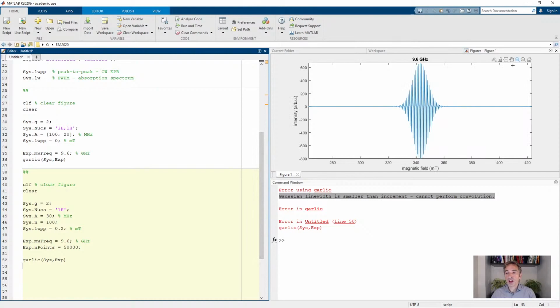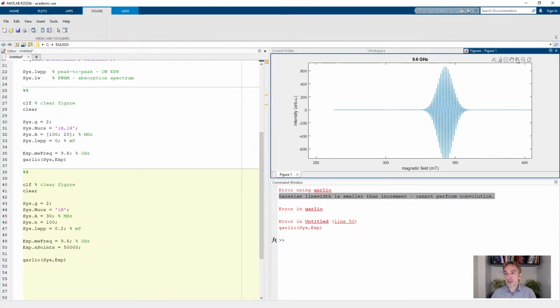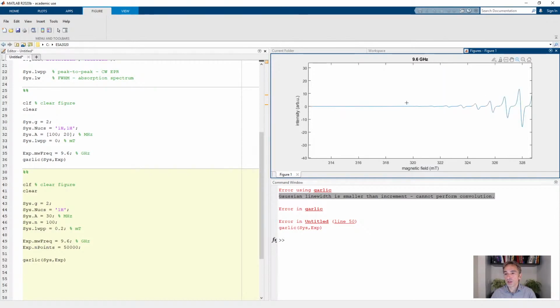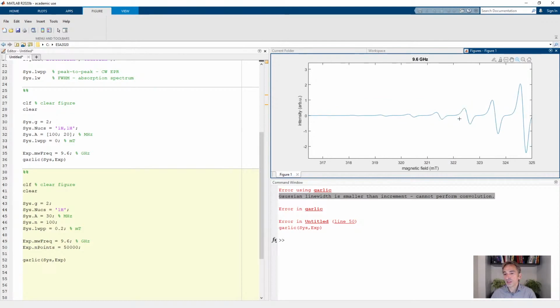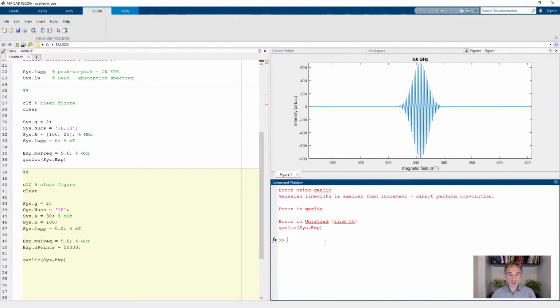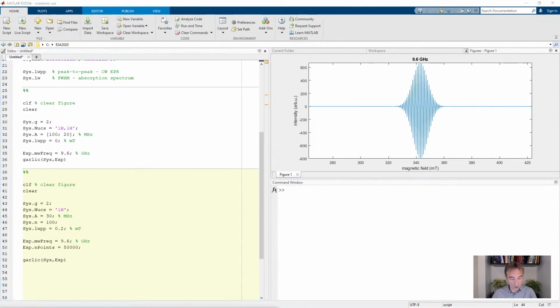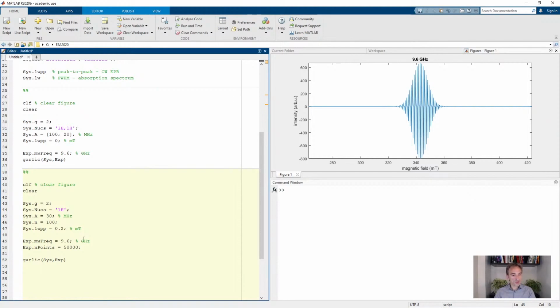This is a spectrum of 100 protons. And if you zoom in to the tails, you'll see there are a lot of peaks that you will probably have a hard time measuring in an instrument because you require such high signal to noise ratio. Okay, so this is how you specify multiple equivalent nuclei. Let's increase the hyperfine coupling, actually, let's say to 100 megahertz. Notice the spectrum here, it looks fairly symmetric, right?